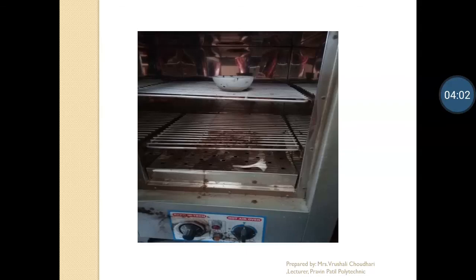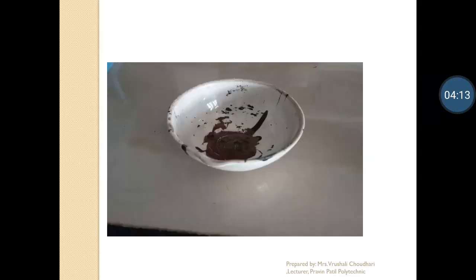This is the electric oven. I kept 120 degree temperature already there. We are going to keep it for 1 hour. Due to the high temperature, thinner gets evaporated, and only the solid remains in this dish, and we are going to weigh it again. So what happened: initially before heating, the weight of this dish is higher, and after heating the weight decreases as the thinner is evaporated. Whatever the decrease in weight, we are going to note down and use for calculation.